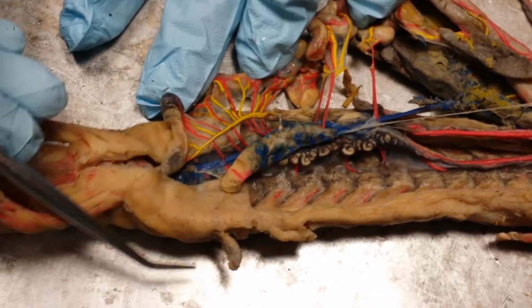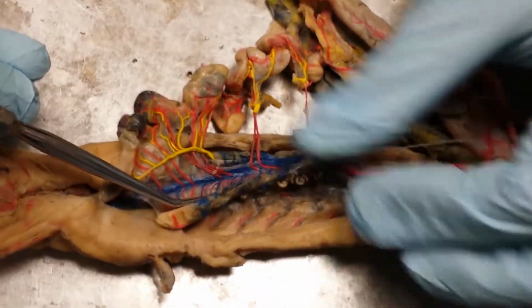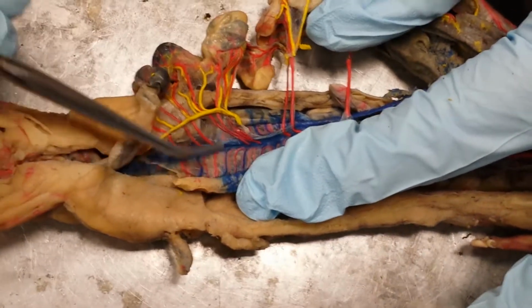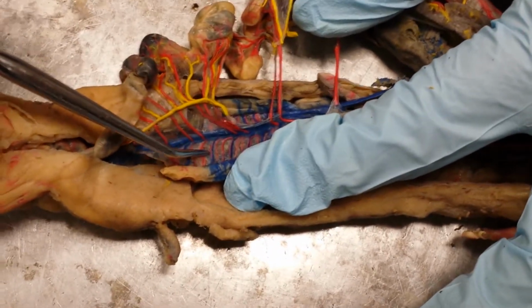The next thing you want to do is look for your reproductive organs. We have a male here. The male testis has pink and blue lines coming from it. The pink lines are the testicular arteries, and the blue lines are the testicular veins.